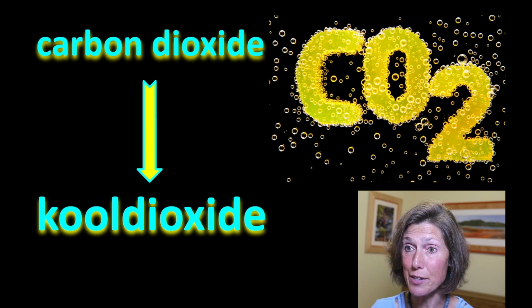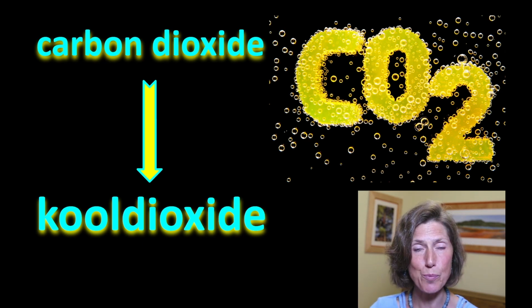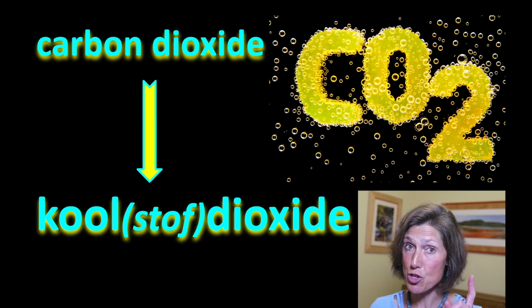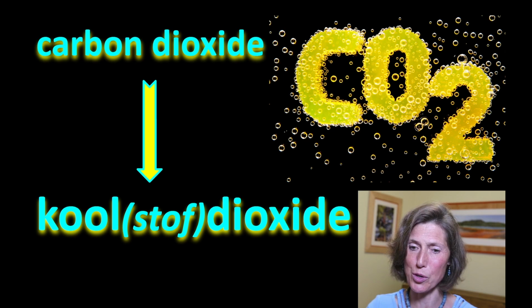Dutch lesson for the day. In this decomposition reaction, the gas that was released is carbon dioxide, CO2. What do we call that gas in Dutch? Kooldioxide. Kooldioxide is really short for koolstof, stof meaning material, and dioxide, dioxide. Not too different from the American word.